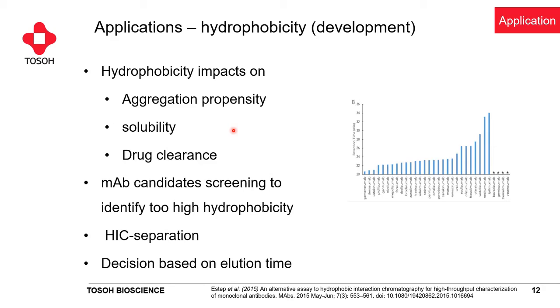So all physiological effects that you can already look at at a very early stage of your drug development, and it's actually very important to do so, because otherwise you would continue with molecules that are much too hydrophobic to at the end have good performance in the body basically.